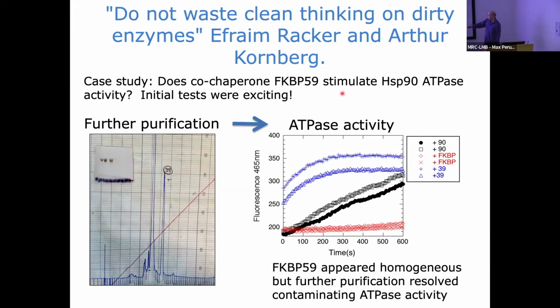But then when you put it in the ATPase assay, here's HSP90, here's FKBP by itself, and then fraction 39 by itself has huge activity. So it was really a contaminating ATPase in there. So that project was back to the drawing board.